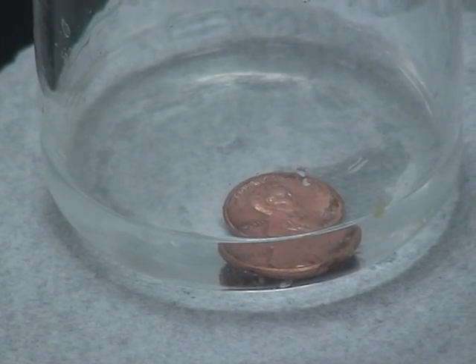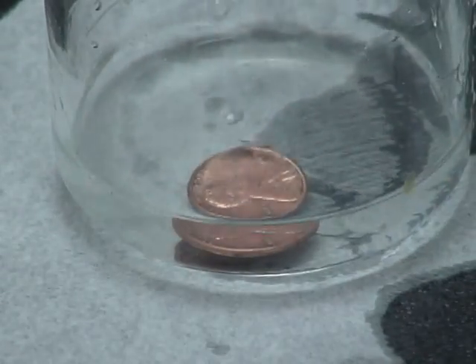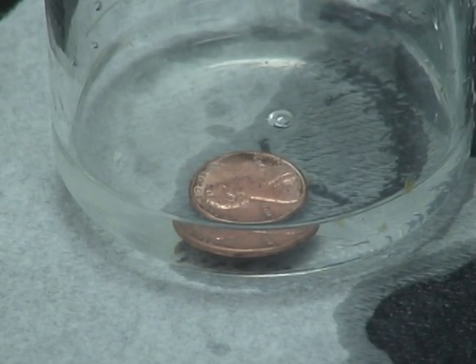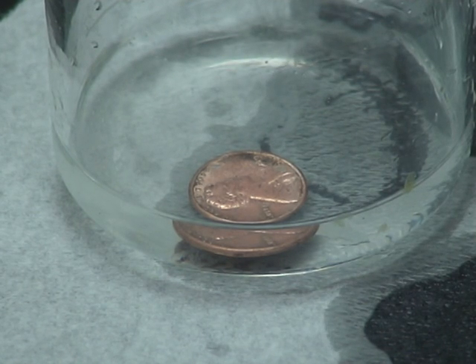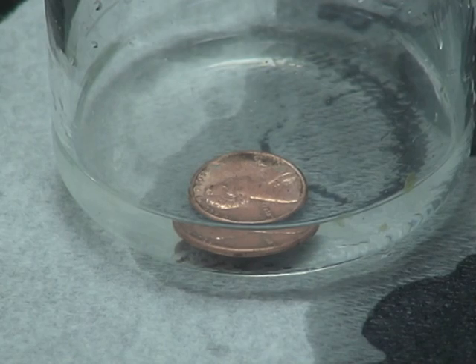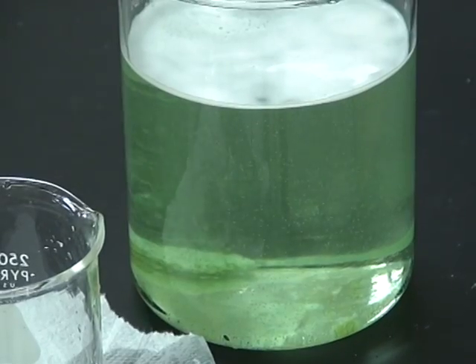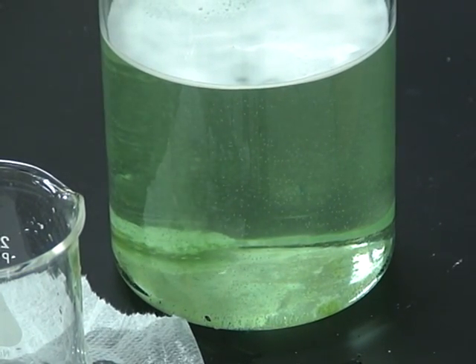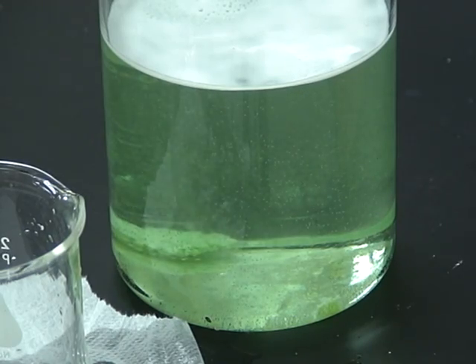Okay, there's our penny. It's much shinier than it was before. Okay. Now, this is not so easy. It did clean the penny, but it's still a penny and there's no copper dissolved or anything. So this is a physical change. Cleaning often is a physical change. It can be chemical, but in this case it's only a physical change. Look at our Alka-Seltzer, it's still bubbling away, and that bubbling does provide evidence that that is a chemical change. A gas is being produced that wasn't there before.